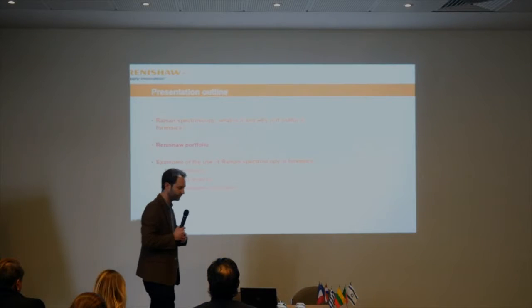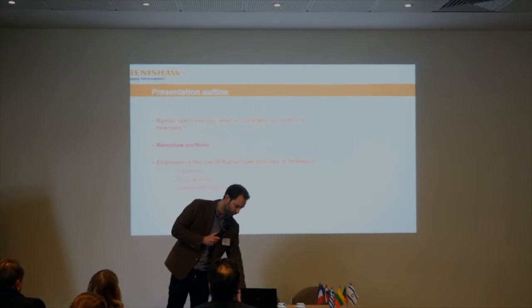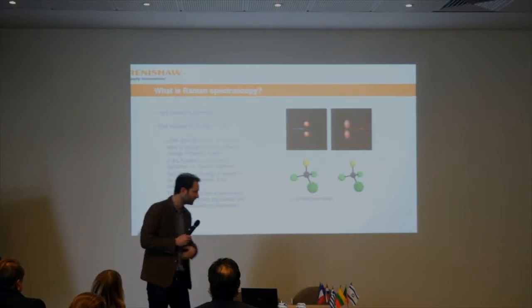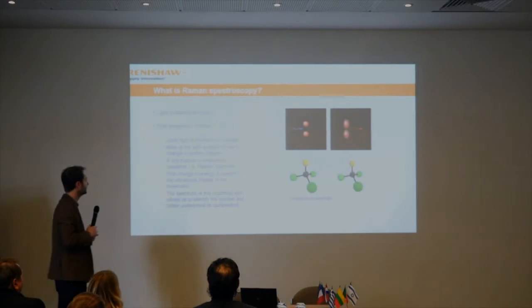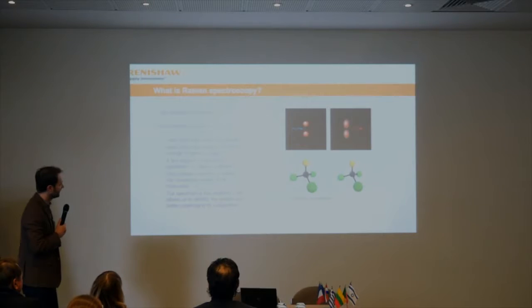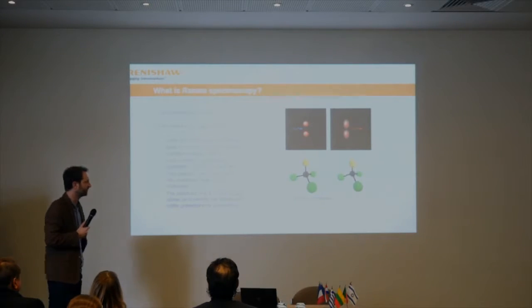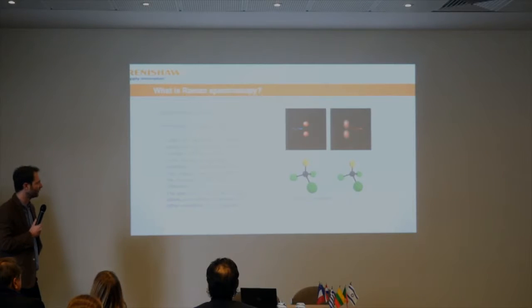I'll explain the type of system we can offer to do these sorts of things. So, Raman spectroscopy, just a brief introduction. It's a light-matter interaction technique. It was first reported by Raman in 1928, and he won the Nobel Prize in 1931 for that.